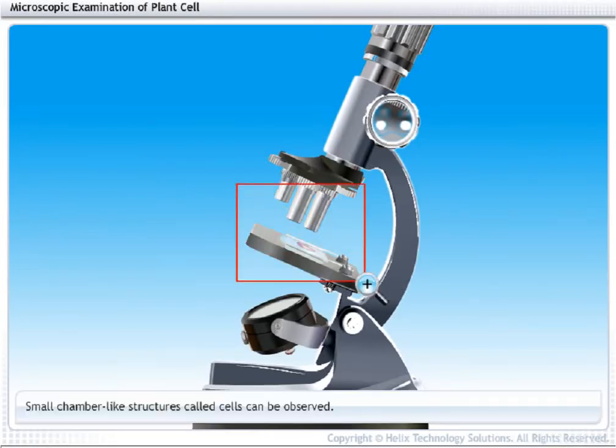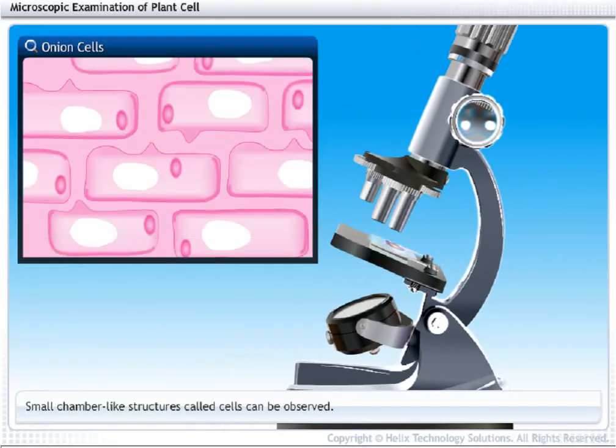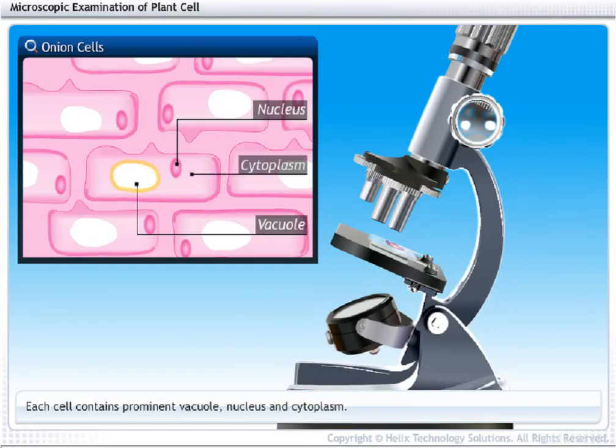Small chamber-like structures called cells can be observed. Each cell contains a prominent vacuole, nucleus and cytoplasm.